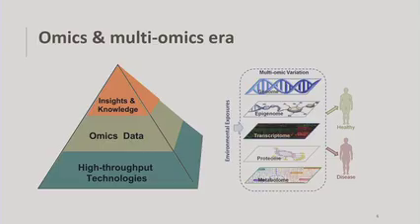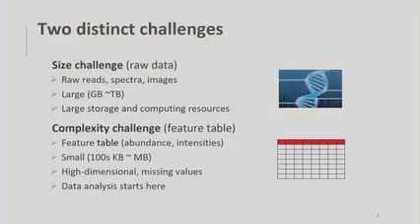And there's a new challenge, multi-omics. If you have multiple tables, how do you do that? This is our latest effort. We are going to touch on it a little bit in my summary later. But today we are going to focus on metabolomics.